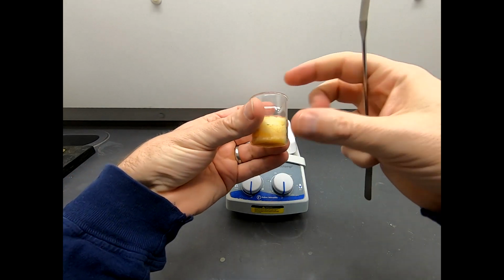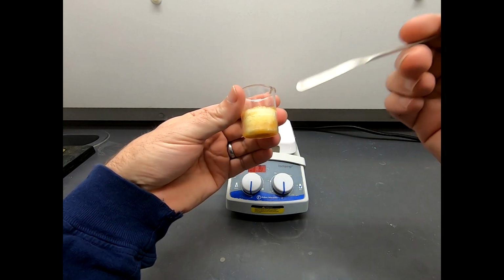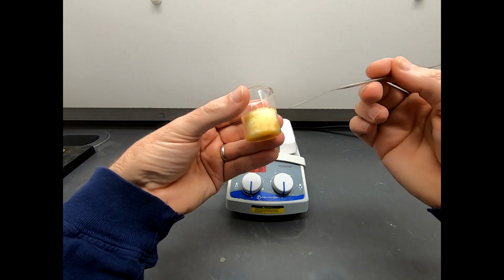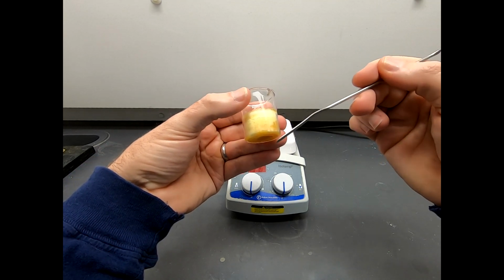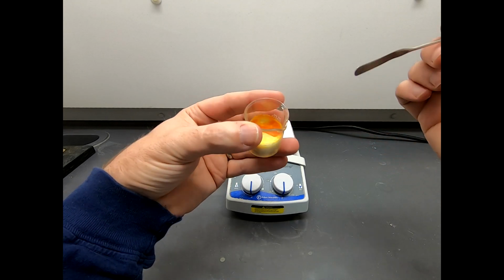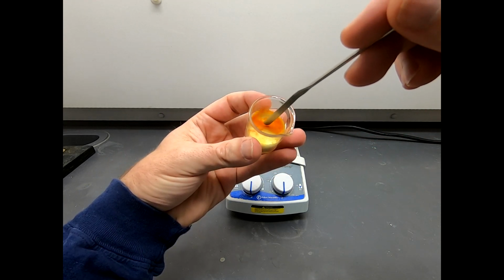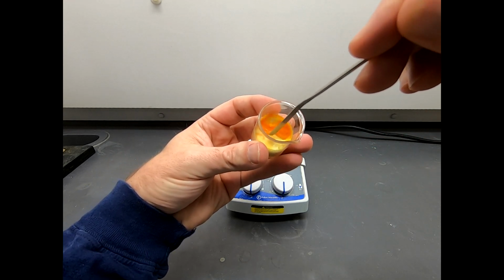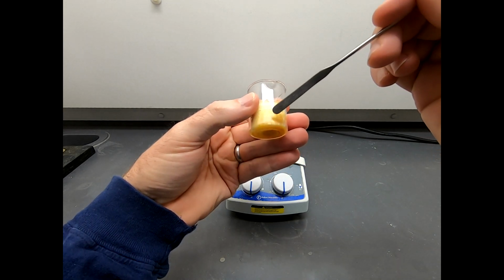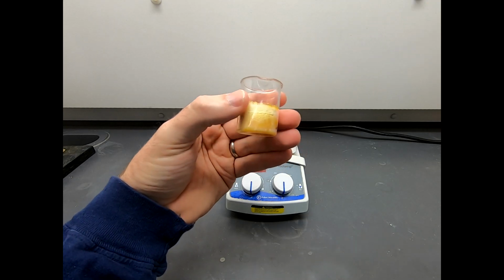So what has happened, and I checked this after about an hour, and it was starting to form some solid, but it was still definitely liquid in here. But now there's no sign of liquid. So what's happened is, as this stuff precipitated, probably the more pure material precipitated first, and then as time went on, the very top was the last stuff to solidify. And you can see that it's discolored. That's really where most of the impurities are. I'm not saying that this is completely pure in here, but this certainly looks less pure, at least based on color.